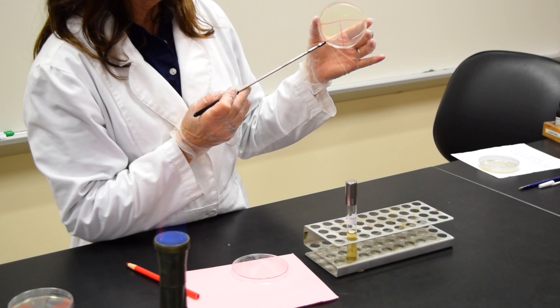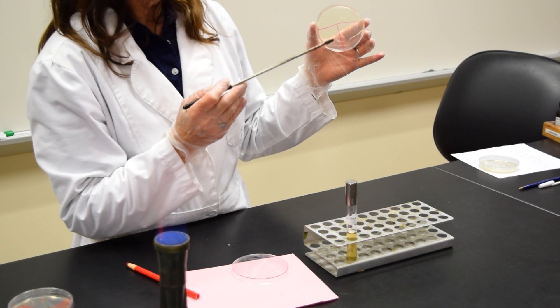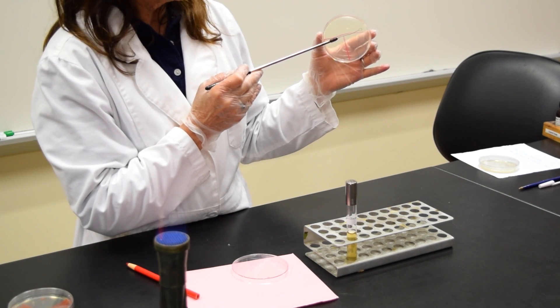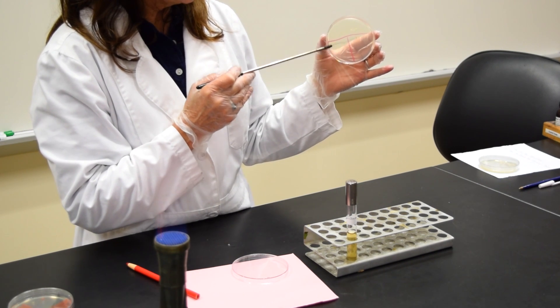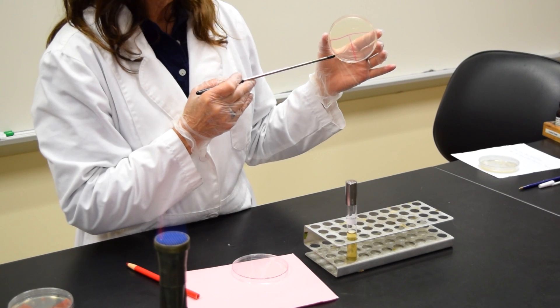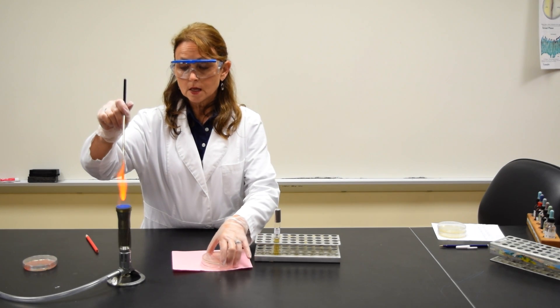I'm going to take the hot loop and touch it in area two to cool it. Go into area one once toward the bottom, pull it out, and streak until you get to the line of the T. Then reheat the loop.